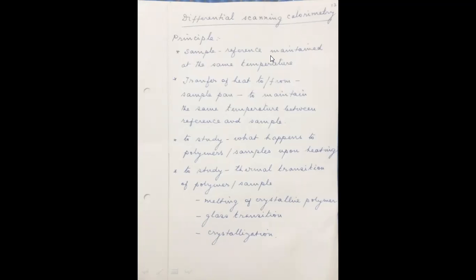The main application of this differential scanning calorimetry is that you can study the actual happenings in the polymers and in other samples while heating. What is happening when the temperature is raised in the polymers? What happens in the other samples? That mechanism can be followed by this differential scanning calorimetry.